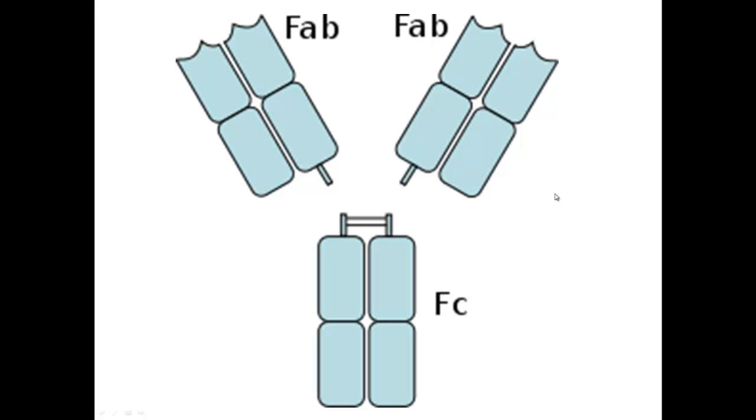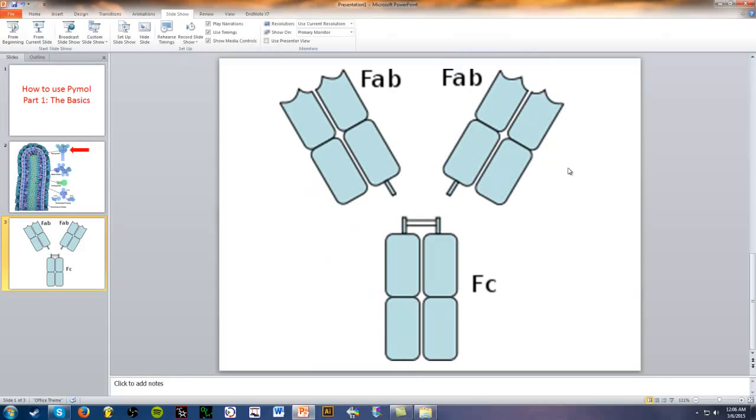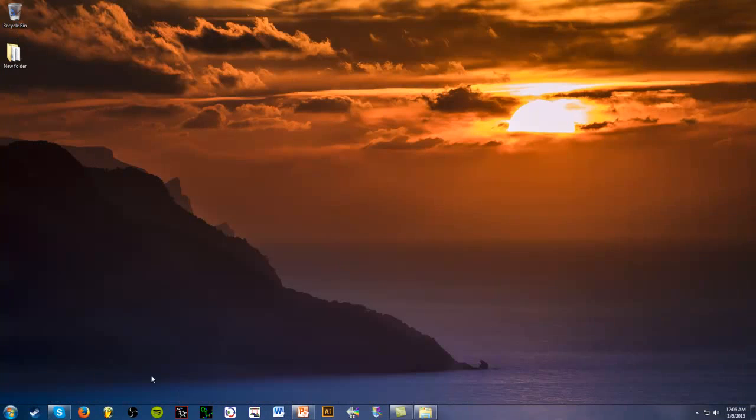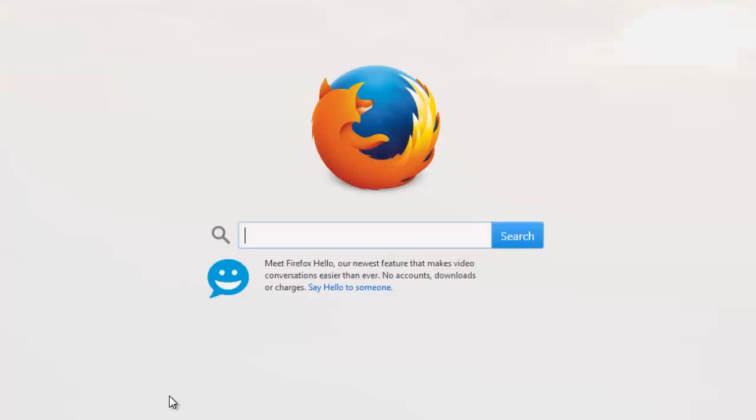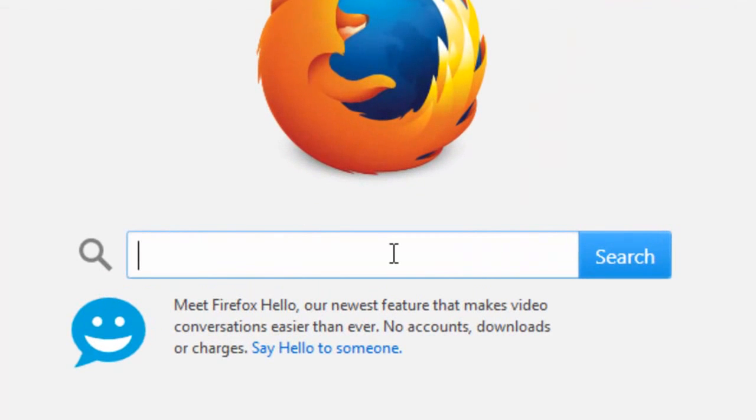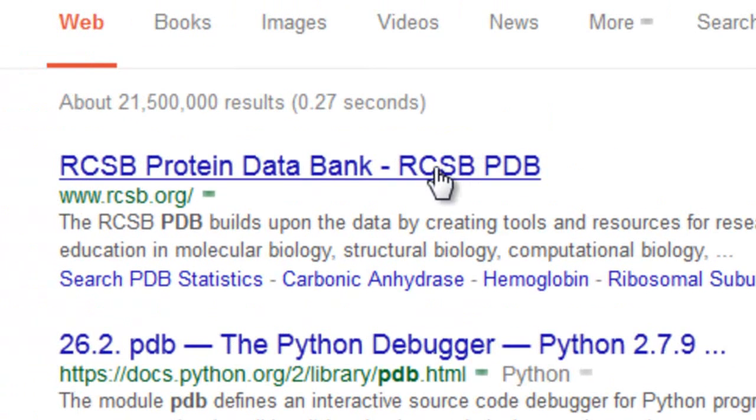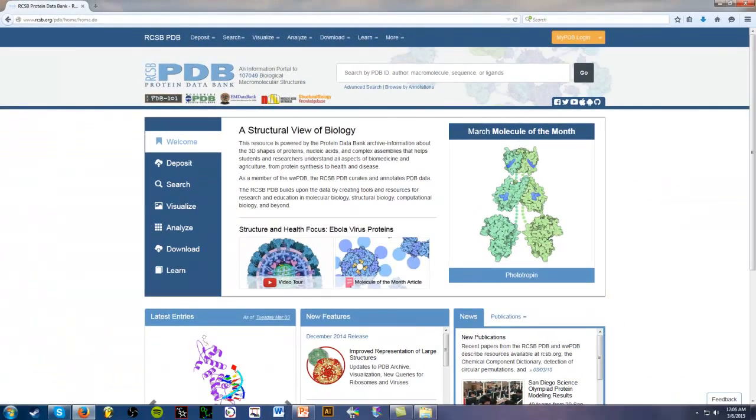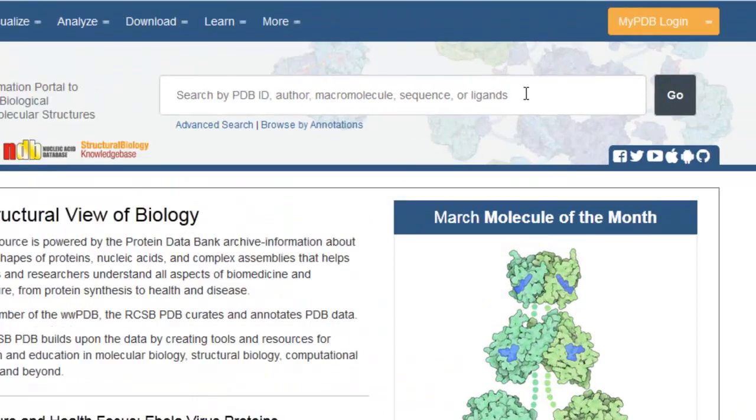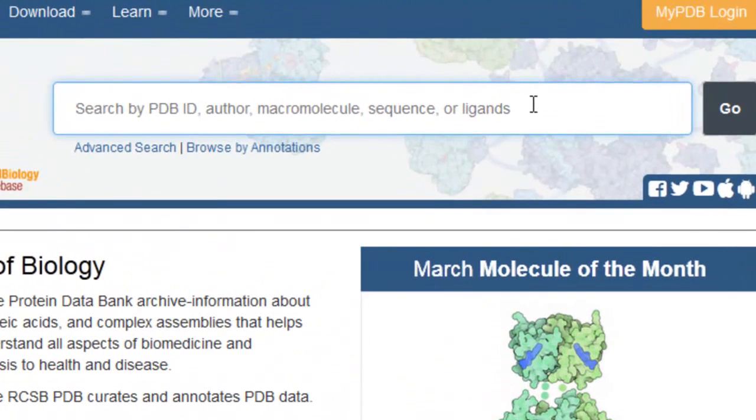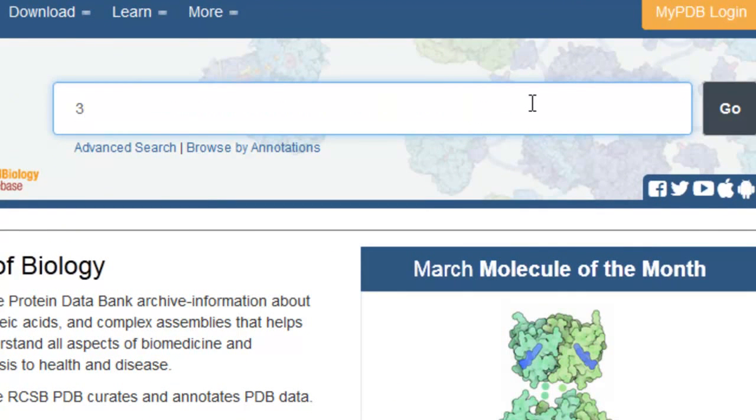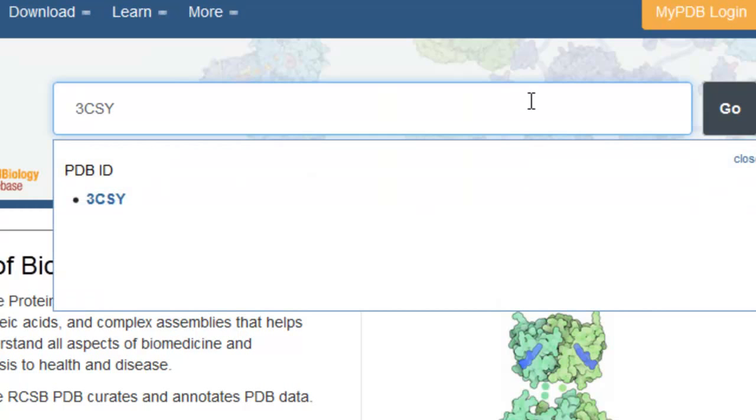So let's get started. We're going to minimize this and go to Google. We're going to type in PDB in Google and the first link is what we want. Here we have the home page of the Protein Databank and we're going to search for 3CSY, I believe.